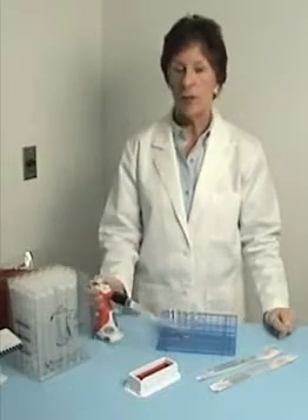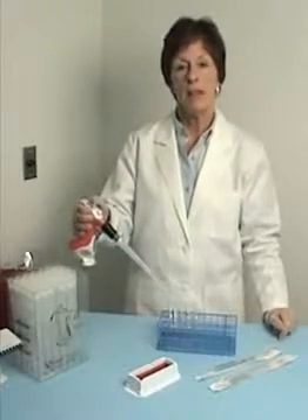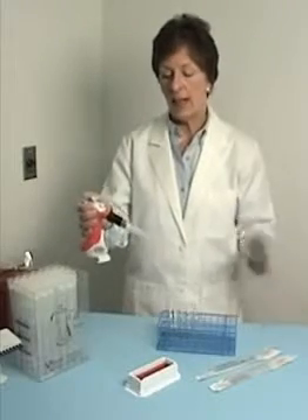Hi, I'm Kathy with Vistolab Technologies and I'm going to show you the Ovation Macro Pipette. This pipette is unique in that it can be used with disposable tips or with your choice of serologic pipettes.